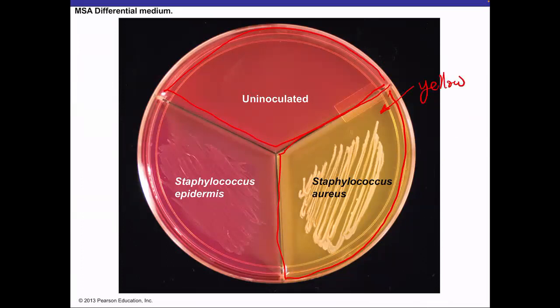And this is something that, for example, Staphylococcus aureus can do. However, if you inoculate other species of bacteria that are halotolerant and can grow there but cannot ferment the mannitol, you will see that the medium doesn't change, or like in the case of Staphylococcus epidermidis, the medium gets a little bit alkaline as the pH of the medium goes up.